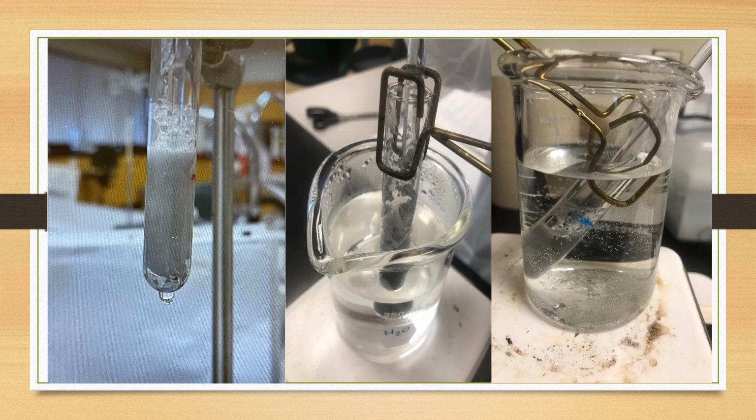As the reaction produces hydrogen gas, you will see bubbles and foam inside the test tube. Use a glass stirring rod to push the foil into the solution. As the reaction proceeds, a small amount of deionized water may be added in order to maintain the solution volume to the marked level.